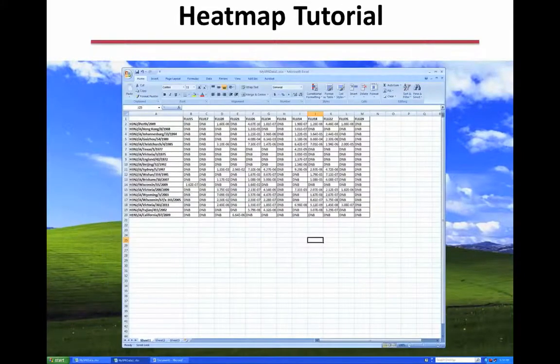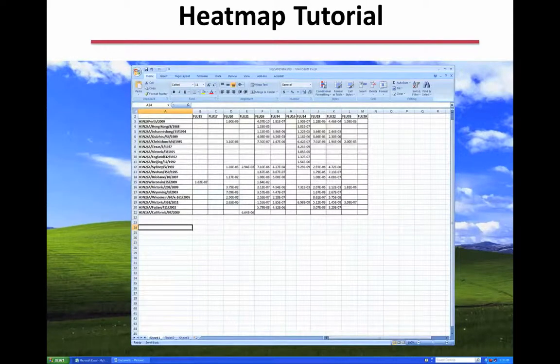To start with, you need your data from the ProteOn, so you can simply copy and paste the values out of your kinetic analysis, and it needs to be saved as a tab delimited text file in a very specific format. The first thing is to delete all of those DNB annotations. In my table I had put DNB wherever the antibody did not bind, but that won't work with the clustering software, so it needs to be just a blank space for those.